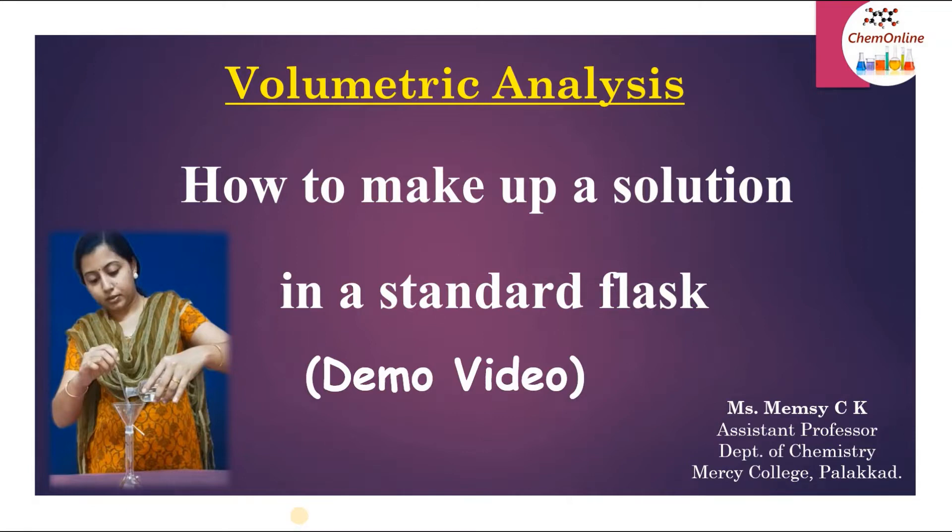Dear students, in this video we will learn how to make up a given solution to a desired volume using a standard flask. This is a very important skill that you should learn for doing the volumetric practicals. You will be provided with an unknown solution and you have to prepare it to a desired volume, say 100 ml or 250 ml, using a standard flask — this is called making up of the solution. This is a practical demonstration video on how to make up a solution in a standard flask.